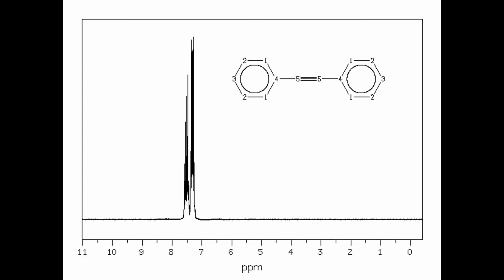To make sure truly, we can also run an NMR. Again, the only hydrogens that appear on our compound are the ones on our benzene rings. So we can see that there should be 3 peaks, 1, 2, and then on the farthest edge, 3.